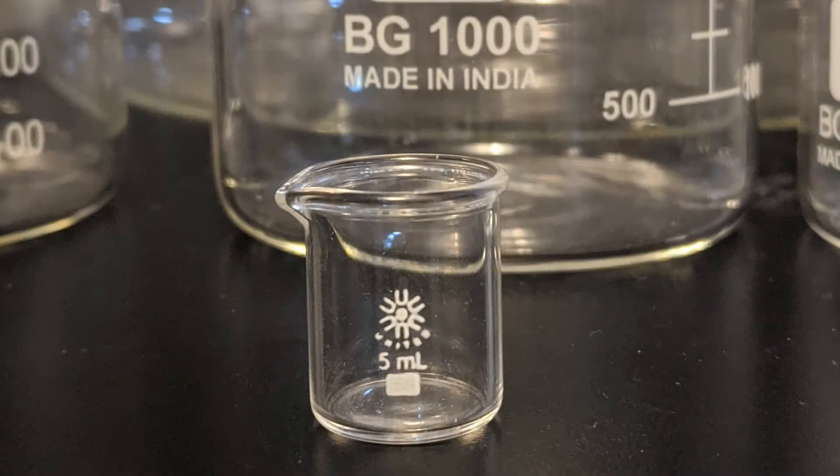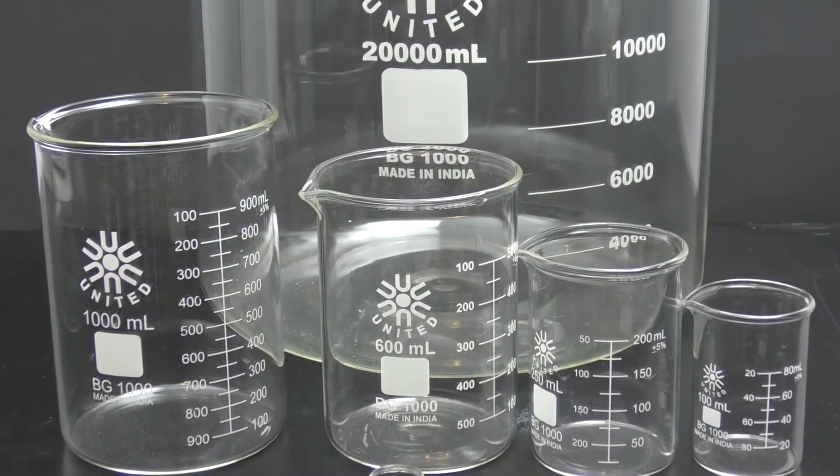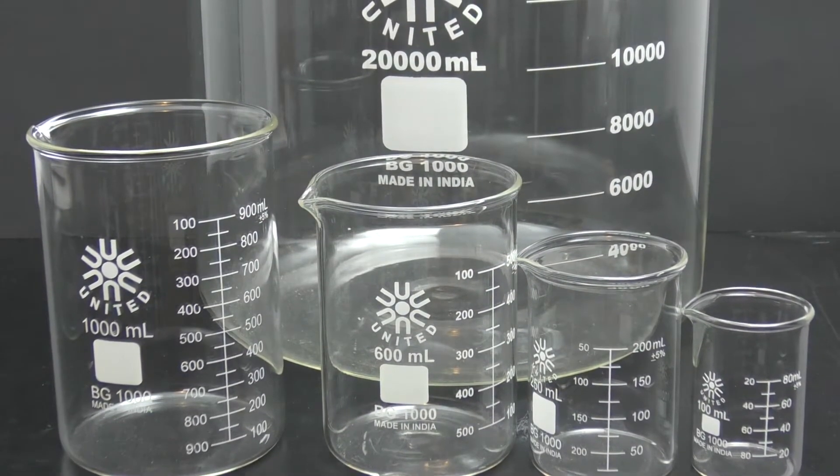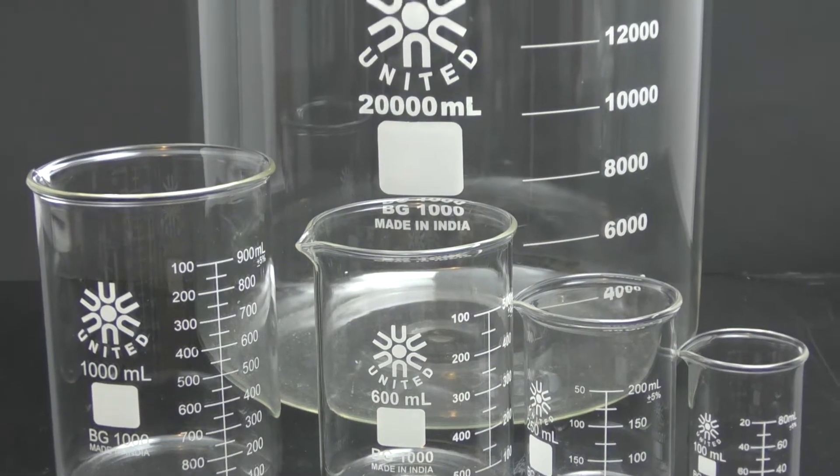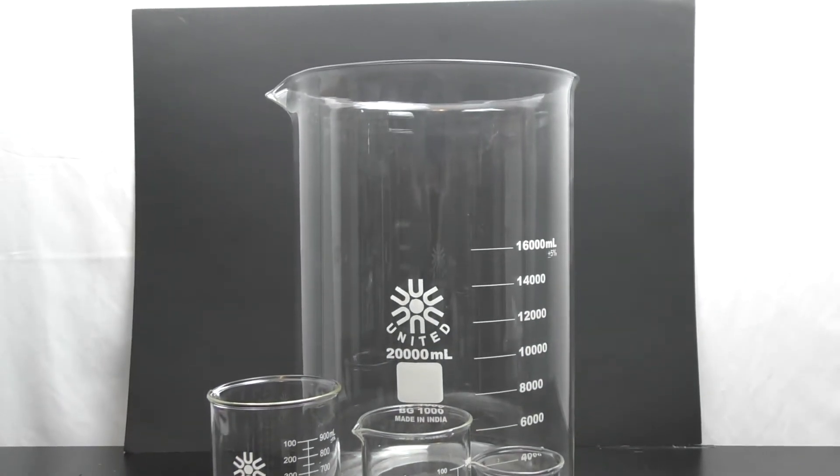The beakers come in a variety of sizes, from a small 5 milliliter beaker to the traditional 100 to 1000 milliliter beakers, all the way up to the large capacity 20,000 milliliters.